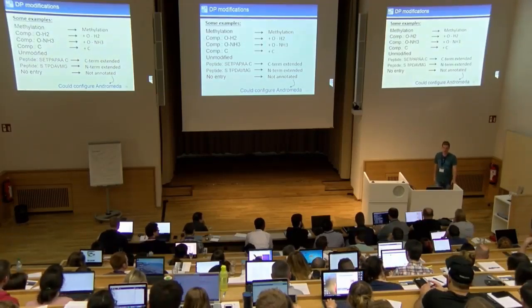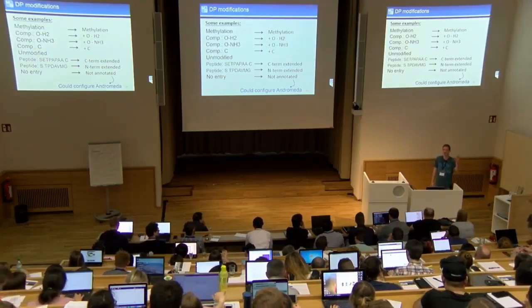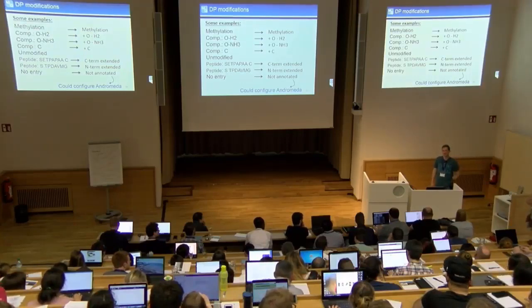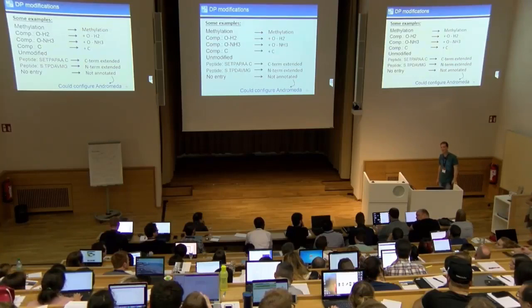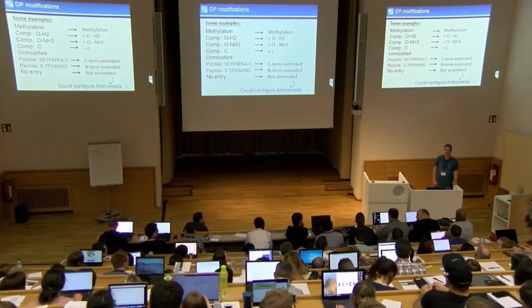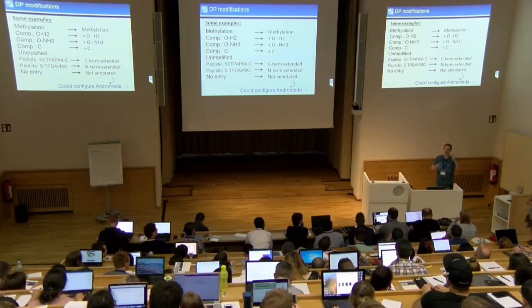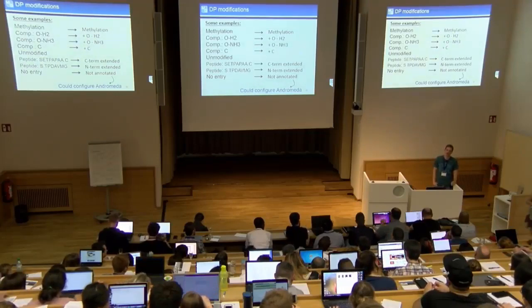So your idea is to put more restriction on the database for the dependent peptides, as in the conventional standard search? I don't think that we tried anything in this direction. It could be helpful, but then you would have to be very precise about how you choose your peptides, and I think it's hard to find general rules which are helpful.